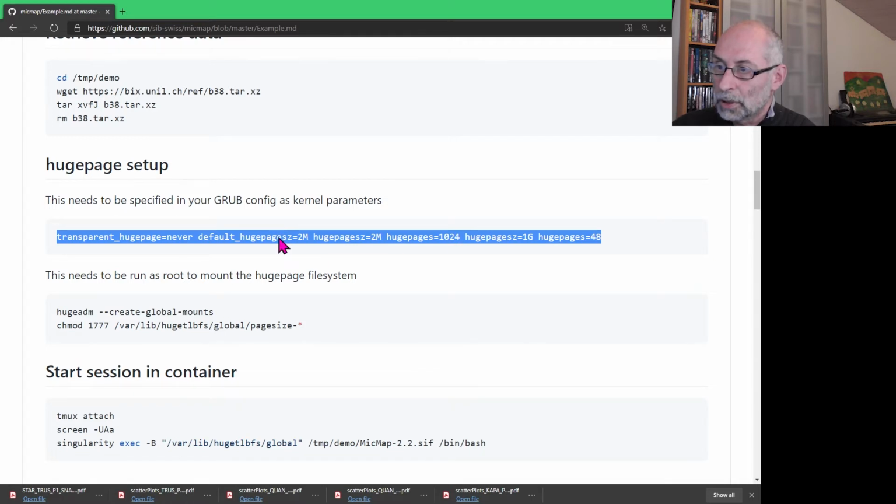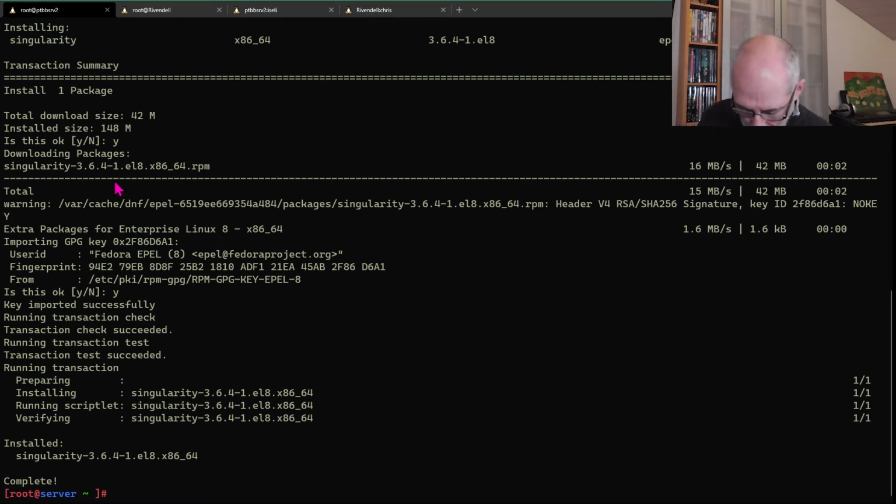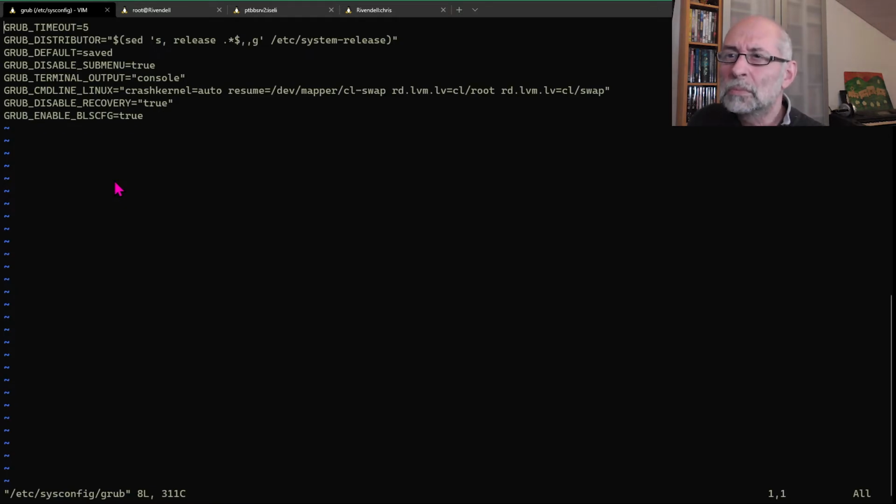So here I'll just copy them and we will need to set them up on the workstation itself. So this needs to be added here.